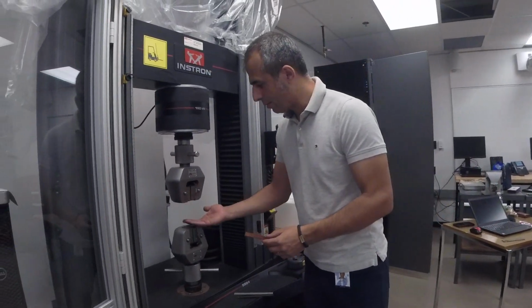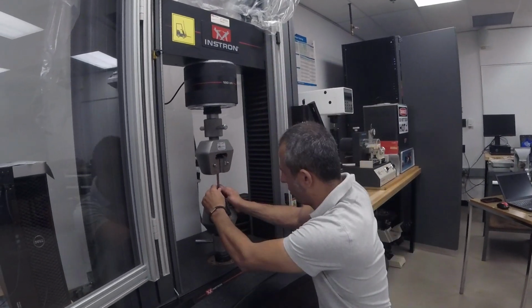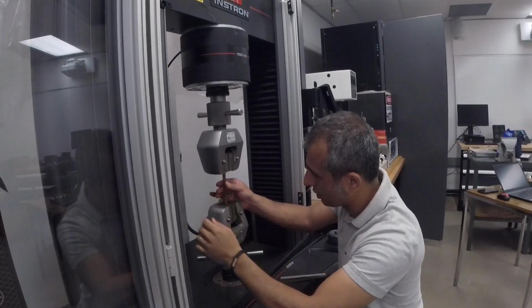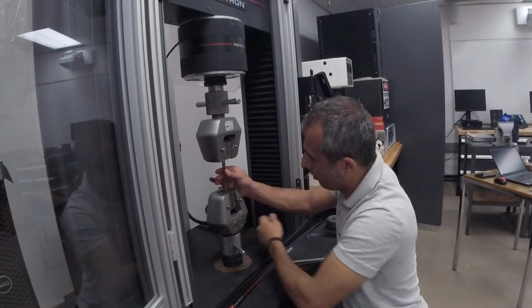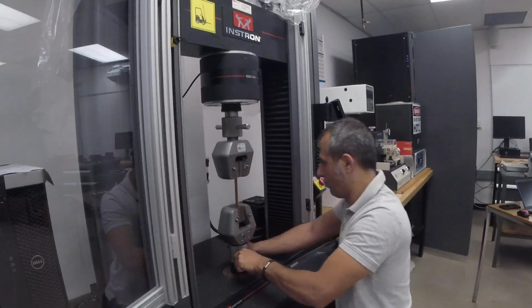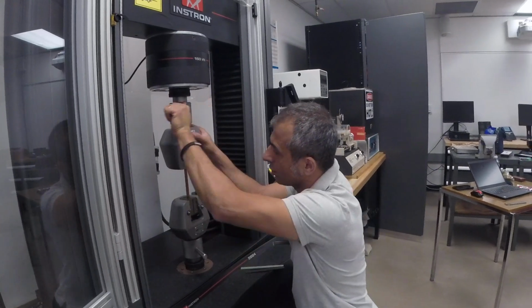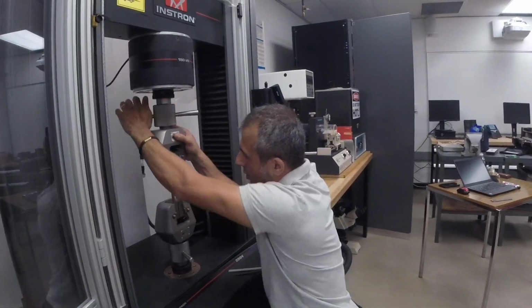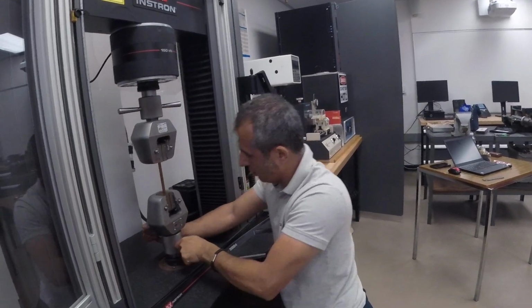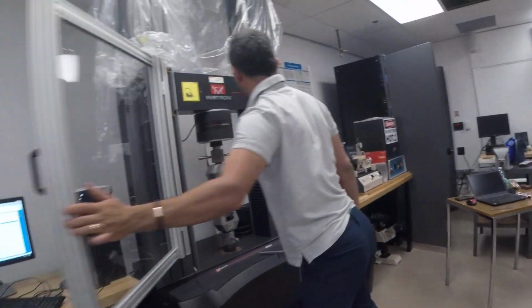Our original length is going to be between those two jigs. So first we need to install the sample properly. So I try to keep it equivalent from both sides, inside. I'm going to fix the jaw first, and then the top one, keep it straight. You're done, everything is fine, so just close the door.